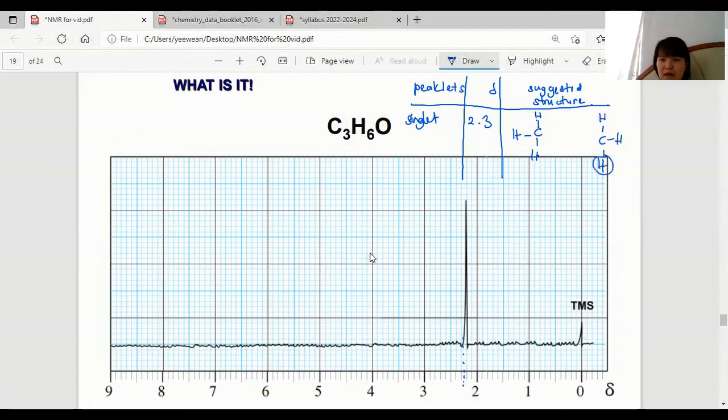Okay, I'm going to circle the occupants so that I do not get them mixed up with the neighbors. They should all have no neighbors because it's a singlet here. So these 6 should have no neighbors. I've already drawn all my 6 H. I've drawn 2 of the carbons. I have 1 more carbon left. And I have an oxygen here.